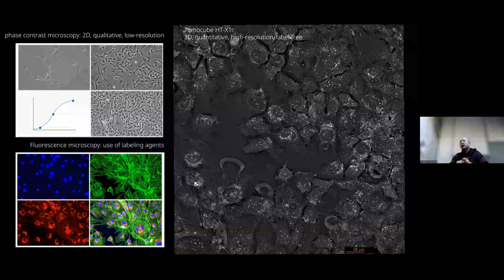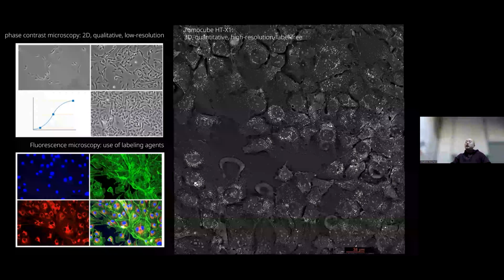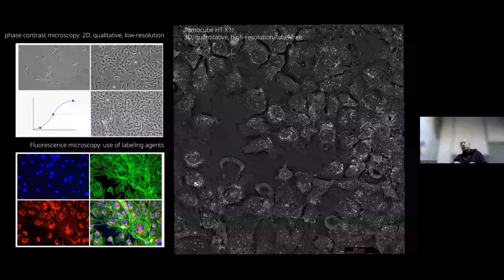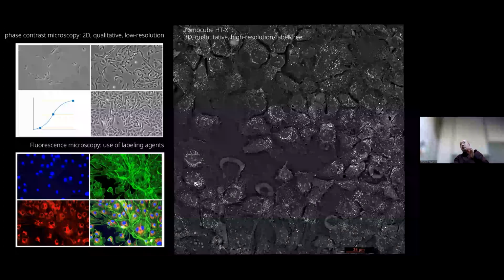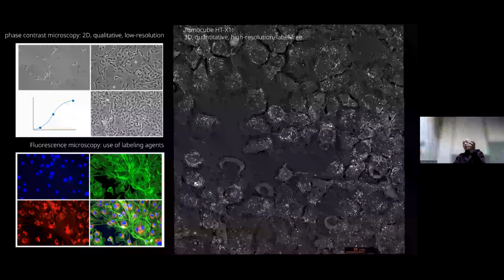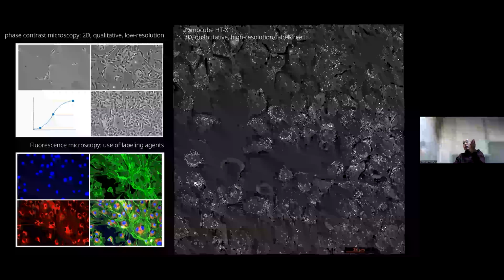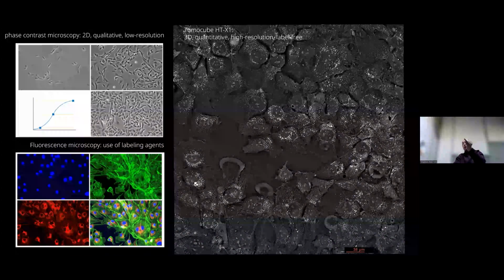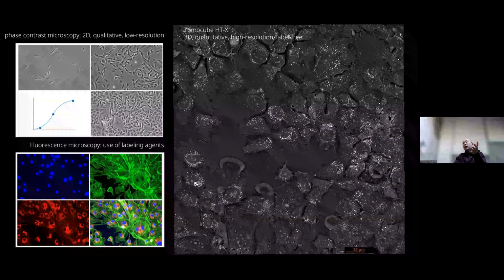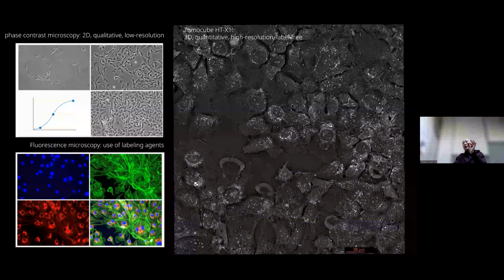But for example, we can also do alternative approaches. If you are interested in studying the endosome, using conventional methods you have to prepare multi-channel fluorescence, like membrane markers and endosome markers, the nucleus and mitochondria. But since HT can readily provide the major subcellular organelles without staining, you can use a single fluorescent channel for endosome.